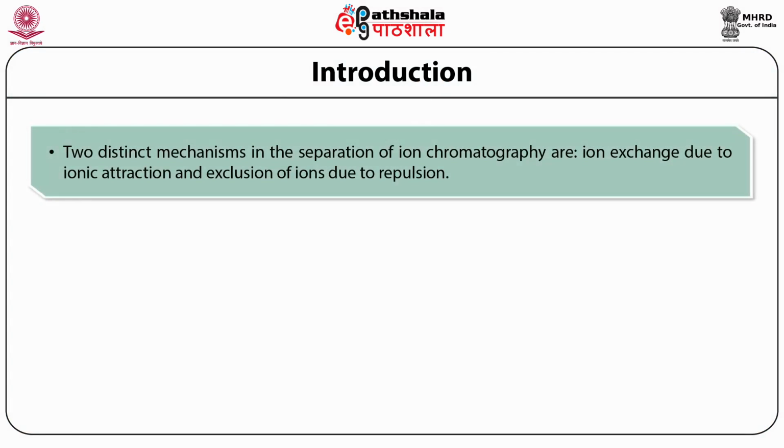Two distinct mechanisms play a role in the separation in ion chromatography: ion exchange due to ionic attraction, and exclusion of ions due to repulsion between similarly charged analyte ions and the ions secured on the chromatographic support.